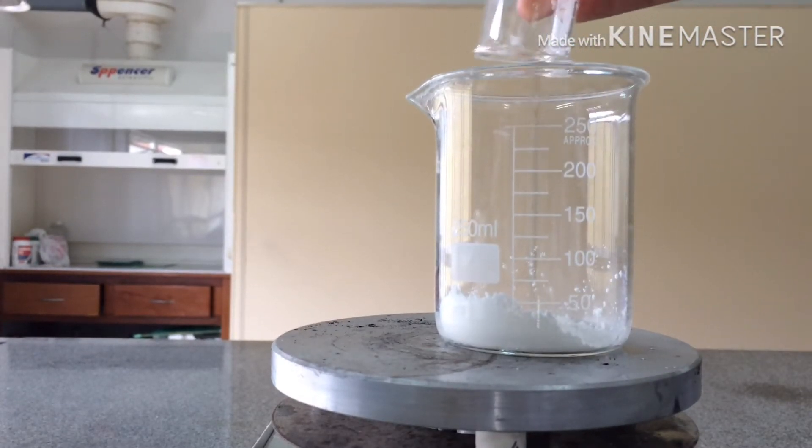Into a beaker you will add 20 grams of potato starch. I'll leave a link in the video on how to extract it.